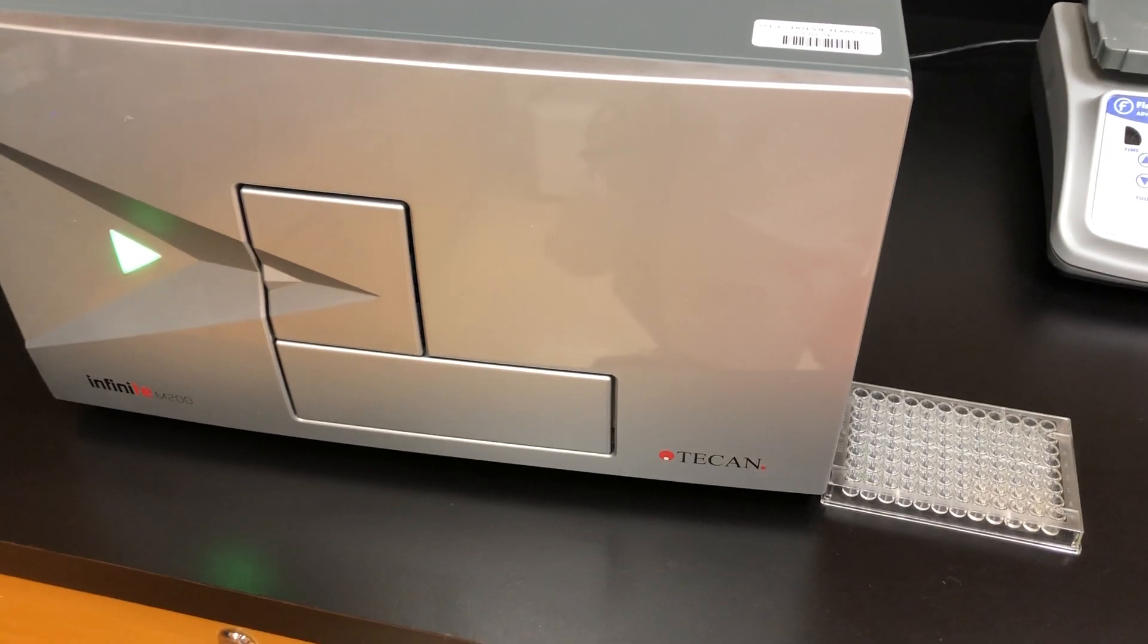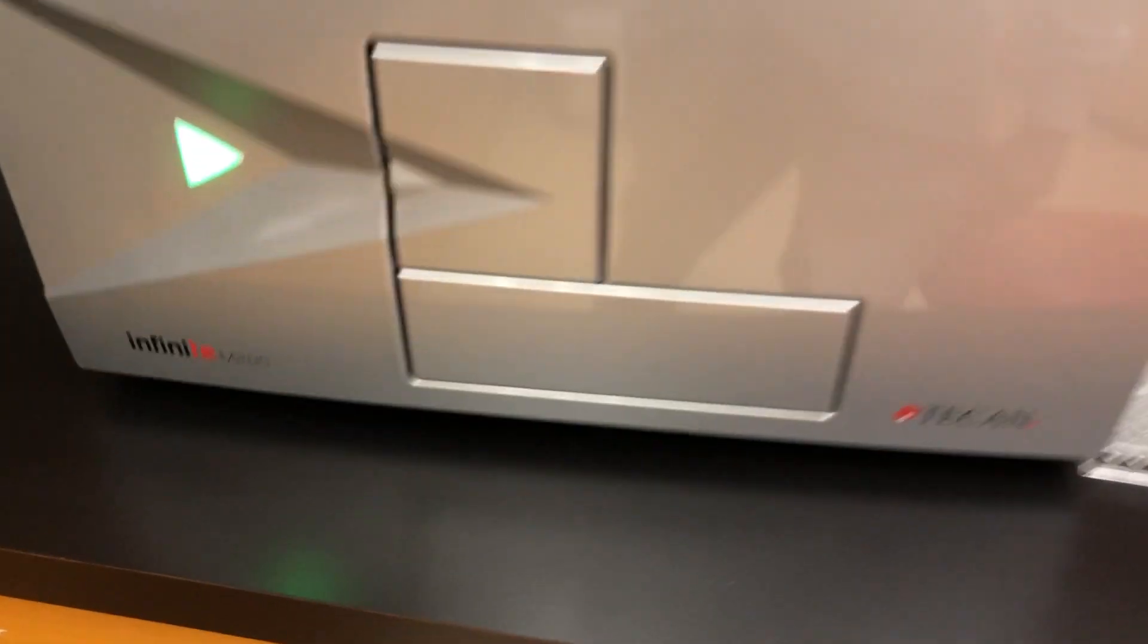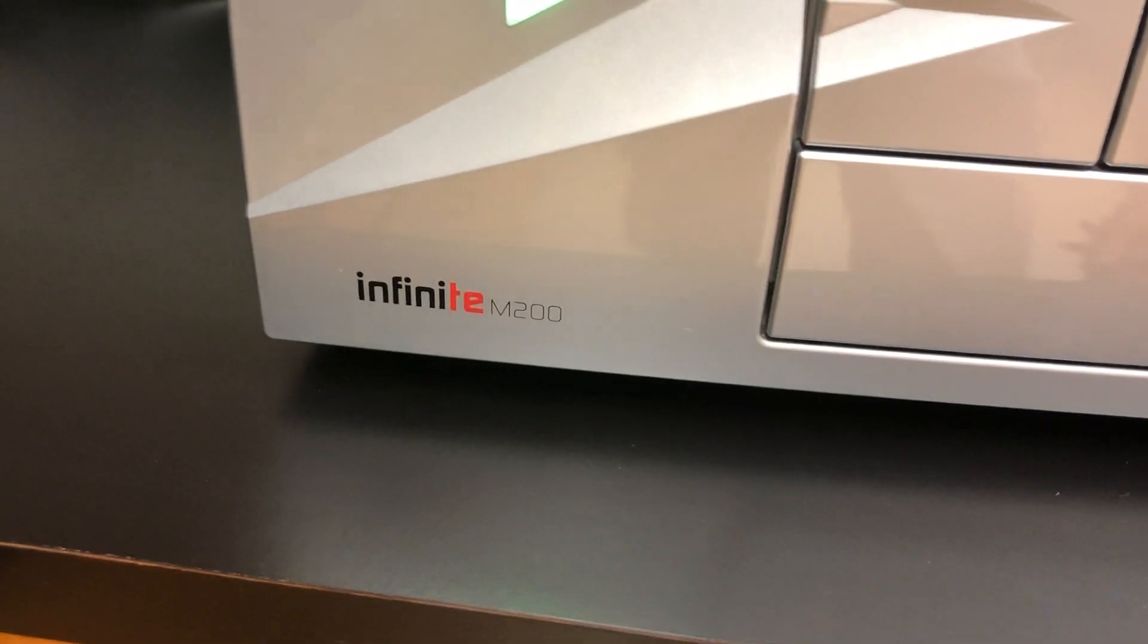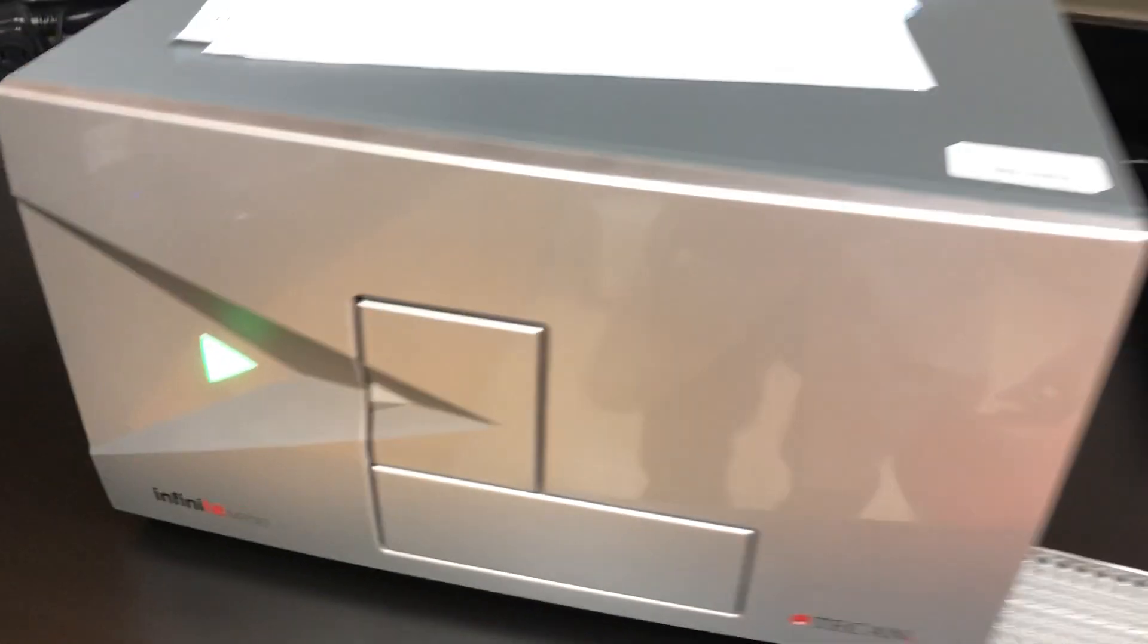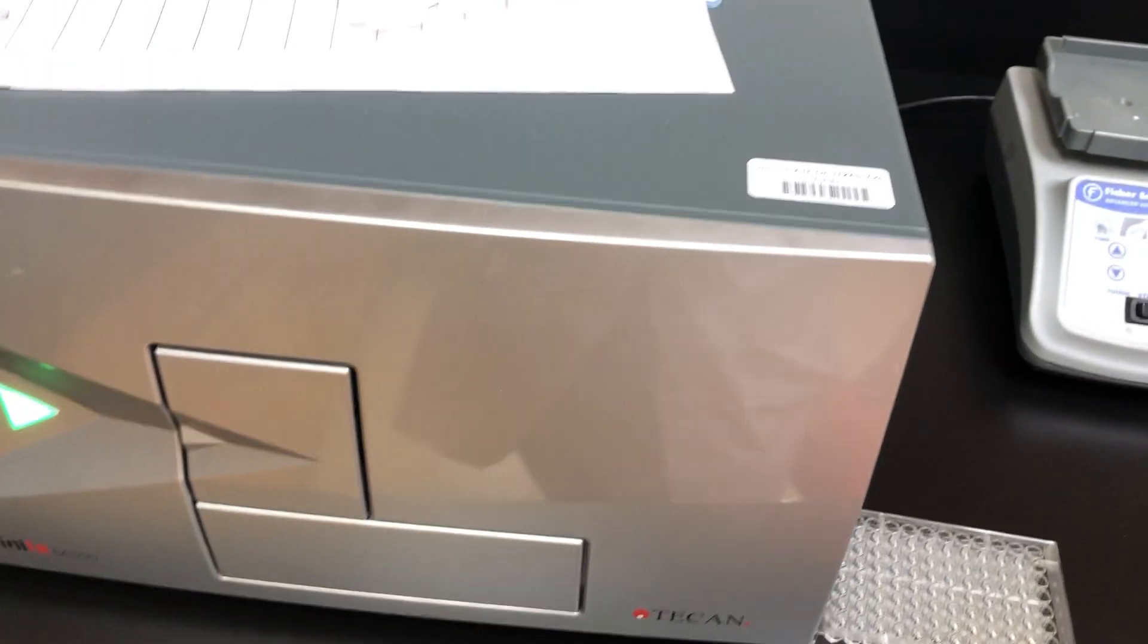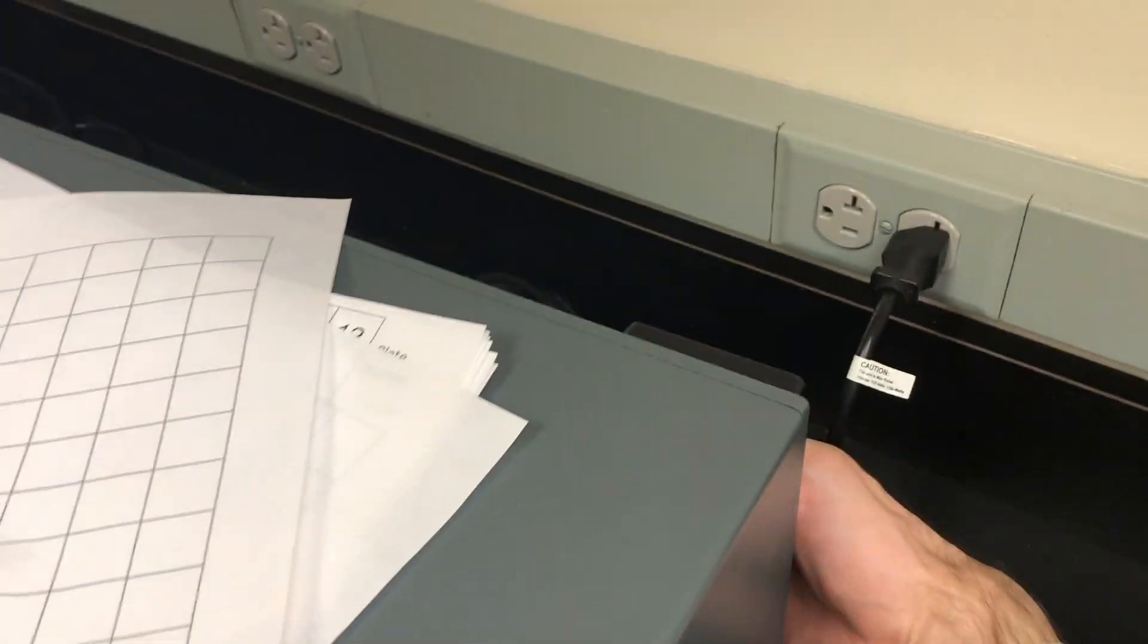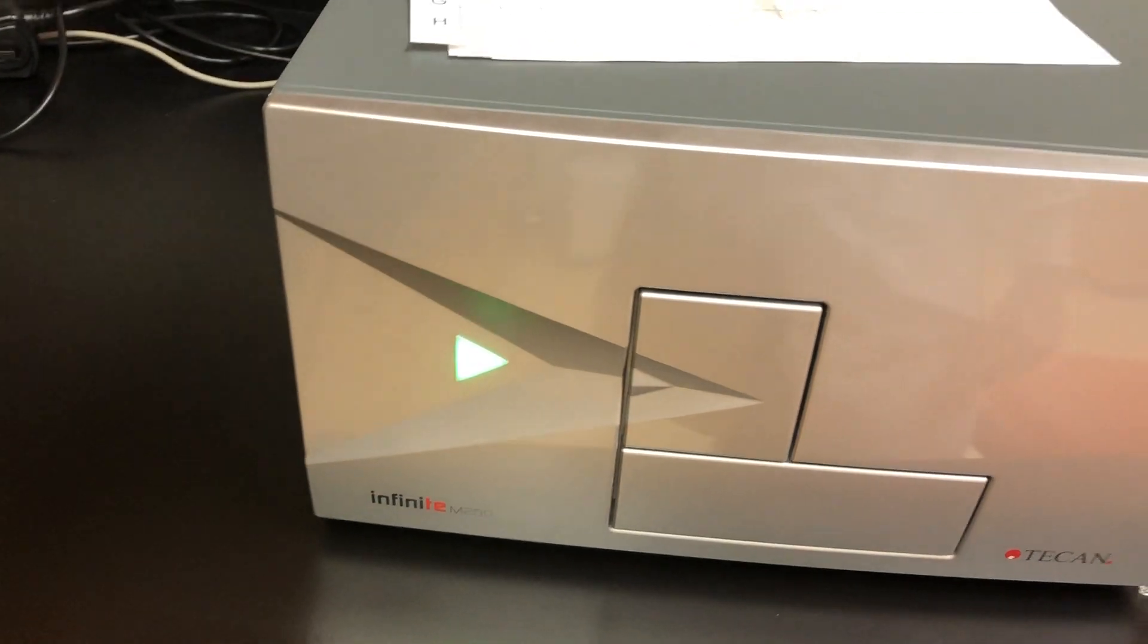This is a quick tutorial on the Teacan Infinite M200 plate reader. First off, there's a toggle switch on the back here, a left-right toggle switch for the on and off, right above where the power cord is. There's a green light there, so we're already turned on.